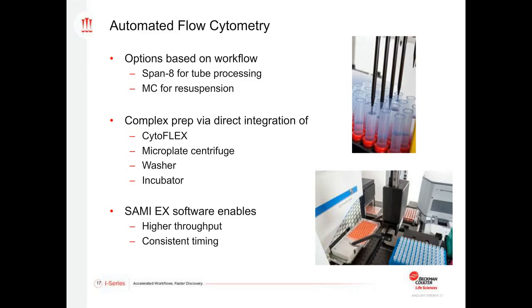And once again, you can put in those type of timing constraints for the steps that are essential. One example would be trypsinization. Obviously, you want to consistently treat your plates, because if you have longer trypsinization times, this could actually change the cell surface expression of some proteins as more of them get cleaved during longer trypsinization treatments.